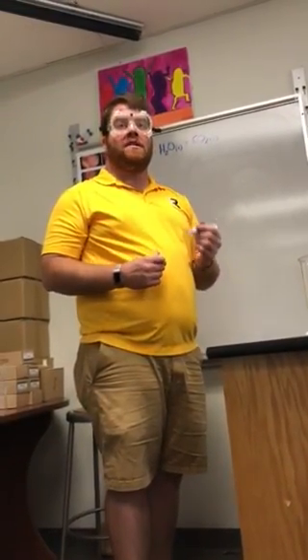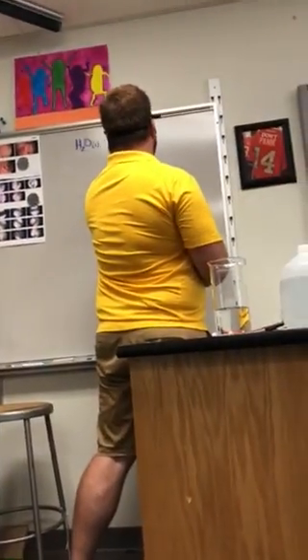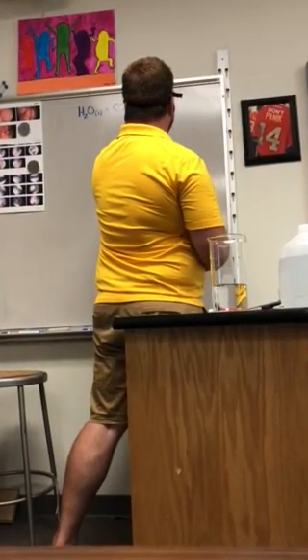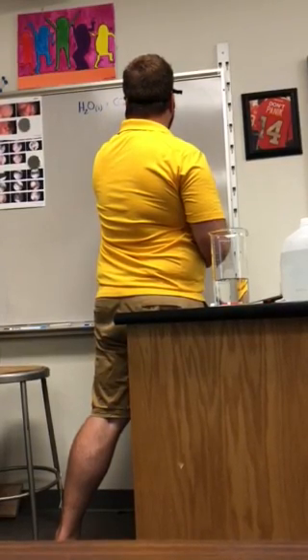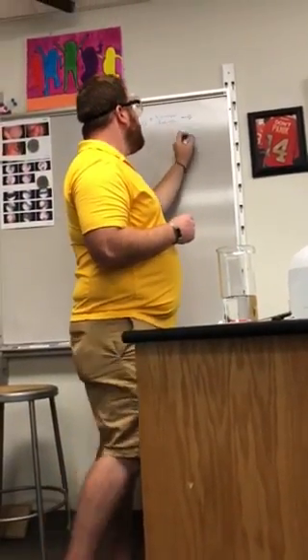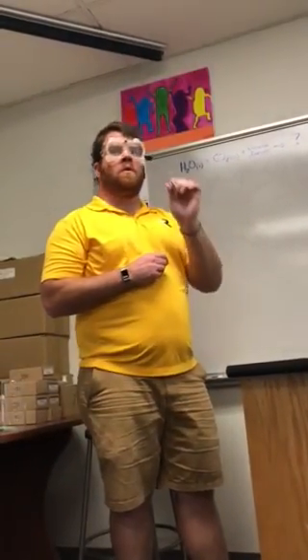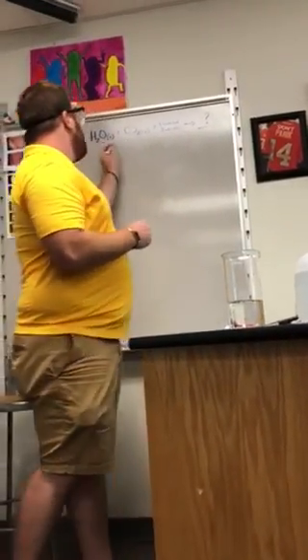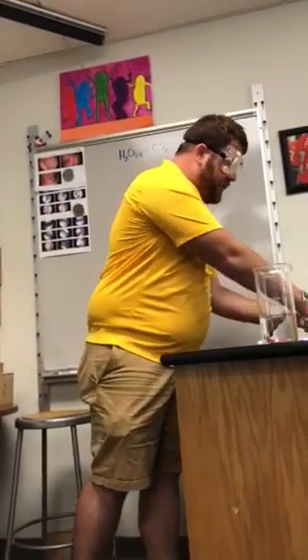So in chemistry, some things have to have something known as an indicator added. Now this indicator is called universal indicator, and it's added because we cannot actually see what is being created. And that is your goal for Friday, is to tell me what this question mark is when we combine H2O and CO2. So I'm going to show you a little demonstration with this, okay?